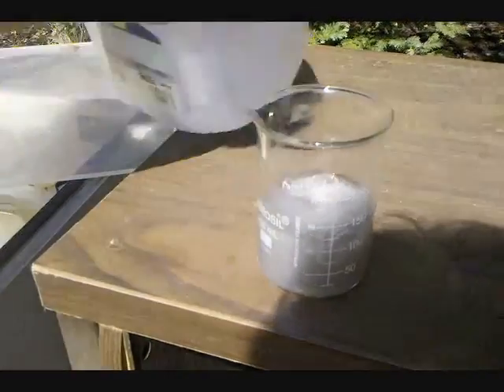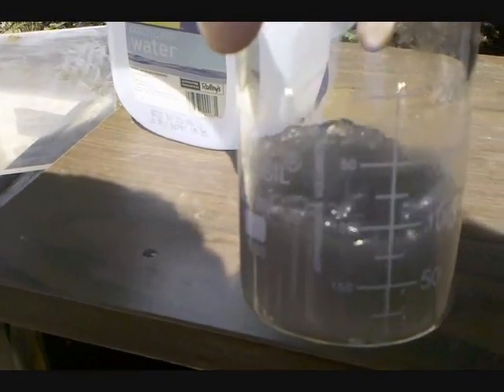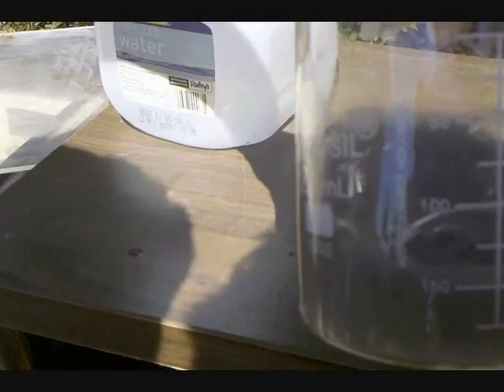What's happening is aluminum is reacting to produce aluminum oxide or hydroxide and hydrogen gas, which you see bubbling out. The gallium is not affected.